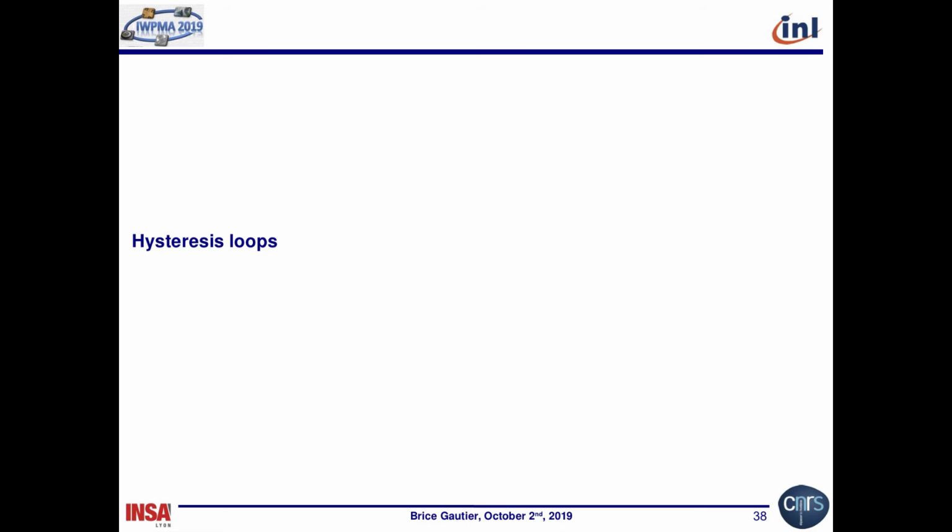Now, hysteresis loops. I believe that hysteresis loops contain the real information. Just because when you are doing hysteresis loops, you don't scan the tip over the surface. So any kind of artifacts arising from the topography are not present in the hysteresis loops. Because what you have to know is that any kind of error that you may have in the topography will be transferred to the PFM signal. So you have to pay attention to what you are doing with the topography. And by doing hysteresis loops, you don't have any problem with the friction, you don't have any problem with the change of the shape of the tip, you don't have any problem with the mechanics.